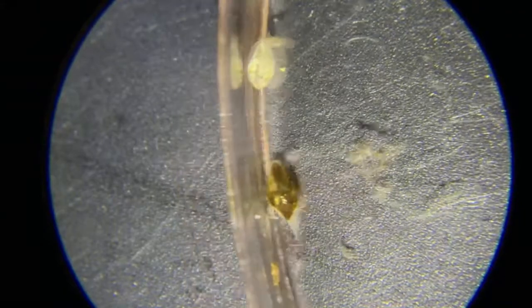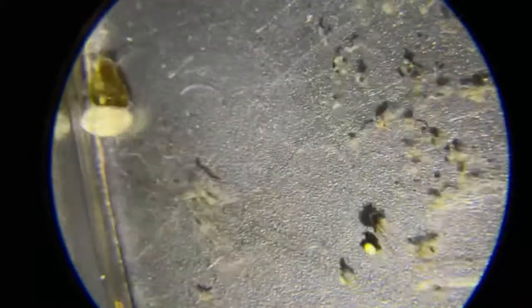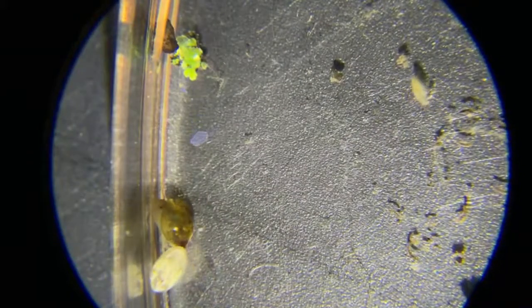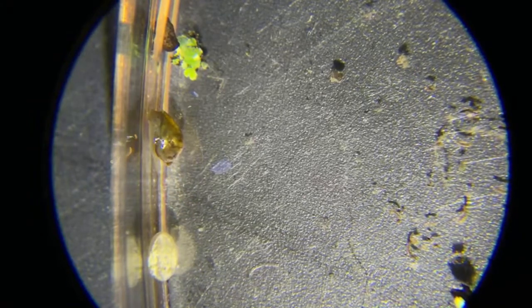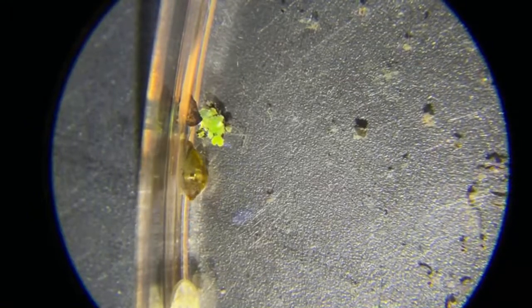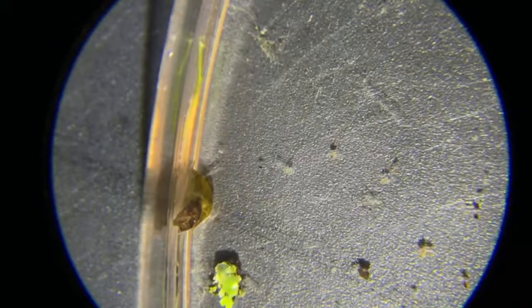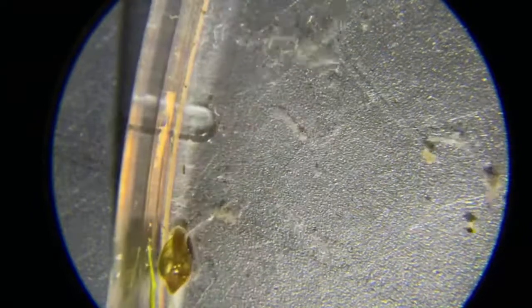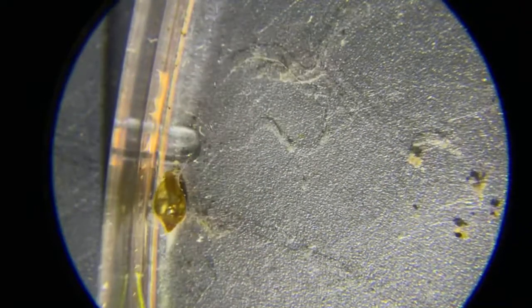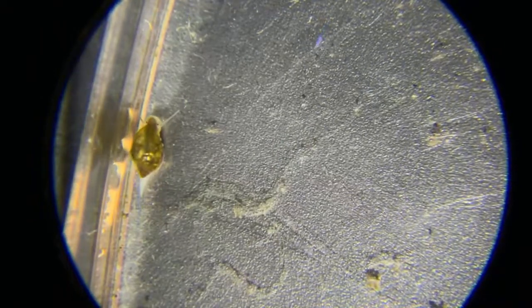Yeah, he's tiny, but he's not as small as those paramecium. Look, there goes, I don't know what that is, a shrimp or something. But look at those little tiny white things swimming around. Those are paramecium, and they're truly microscopic. Even though it looks like you could see them, you can't. They're white, but when I try to look with my naked eye right now, I can't see them.